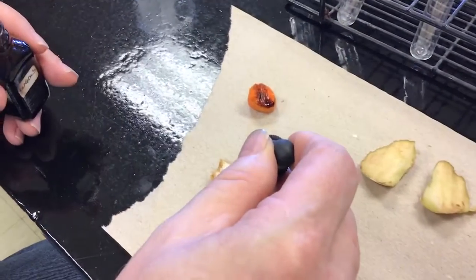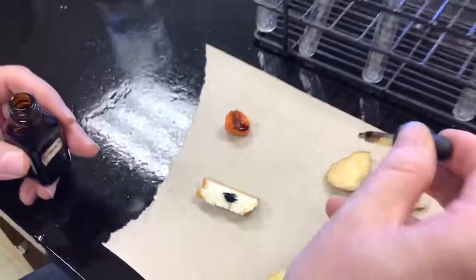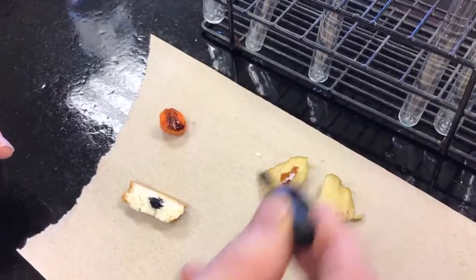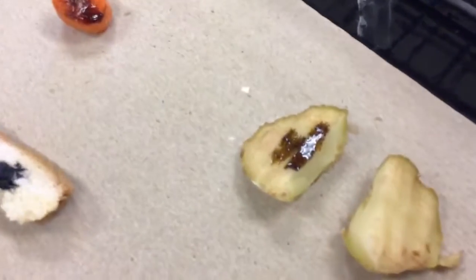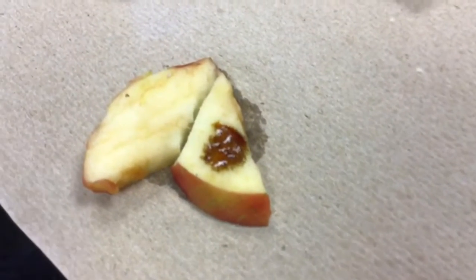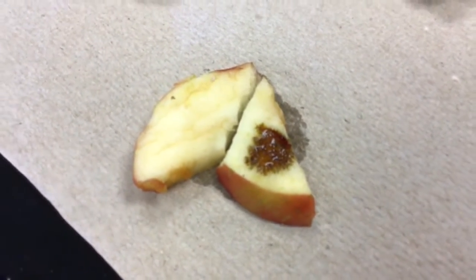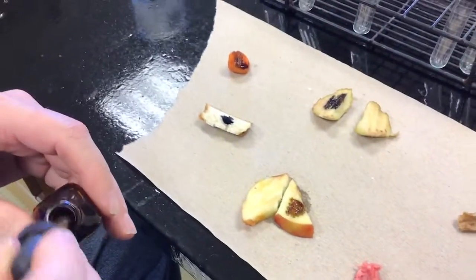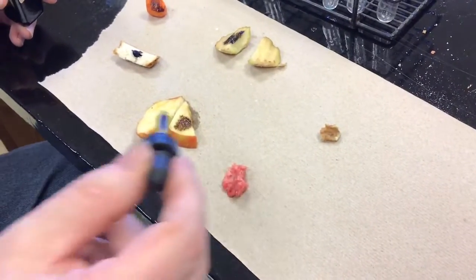Okay, we're putting Lugol's onto the bread. That's a pretty clear change. Putting Lugol's onto potatoes. That's a pretty clear change. Lugol's onto the apple. Little bit, right? You get flecks of black in the drop, which probably would suggest that if there's starch in there, it's not evenly distributed through the whole apple.